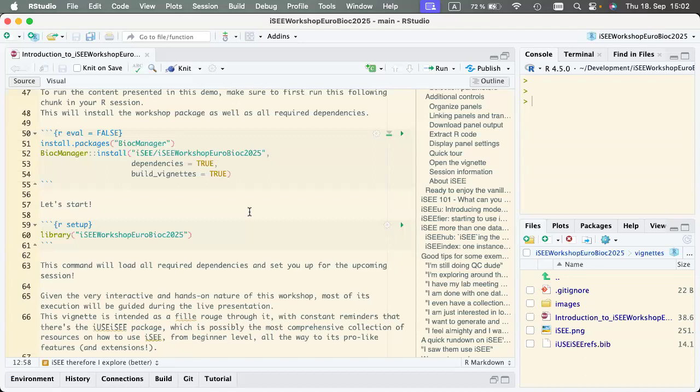And then upset plots. That's actually something that we don't have inside iSEEde, sorry. But actually, you would like to have many of these that are also potentially interactive and possibly talk to each other.